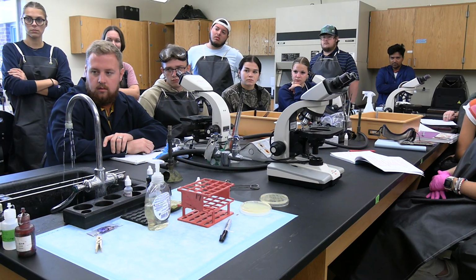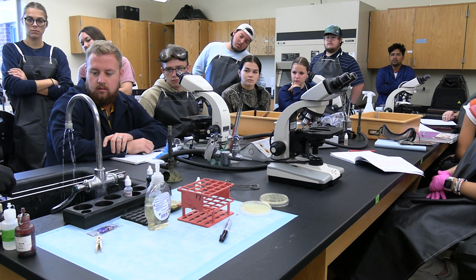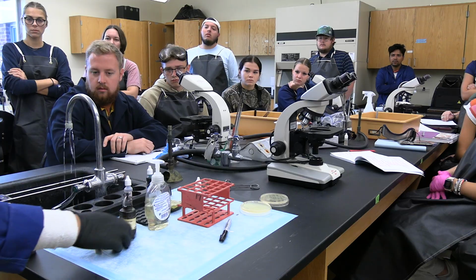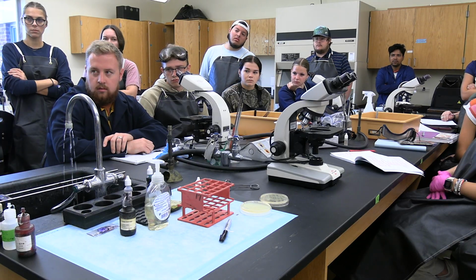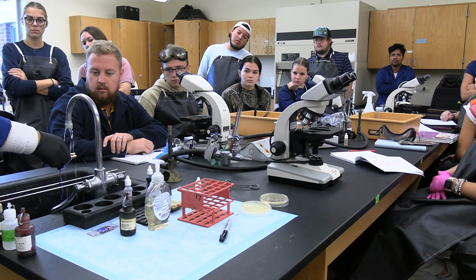First thing, crystal violet. We put it in the middle. Stain for 60 seconds. You can count 60 Mississippi or use a timer. Let's say 60 seconds is ready. So we do a very gentle rinse.